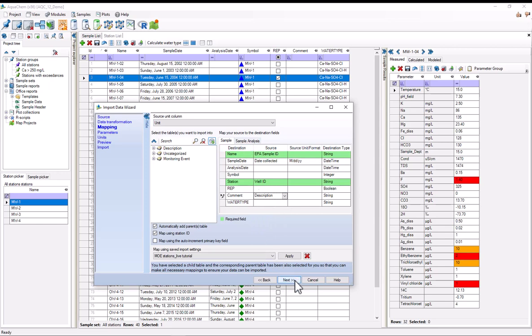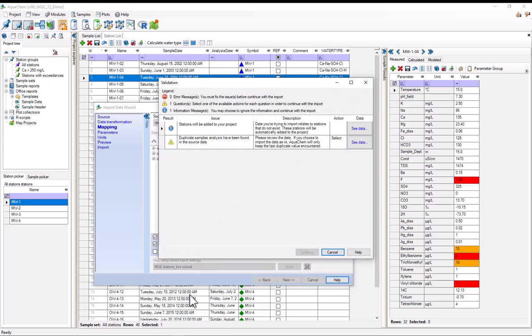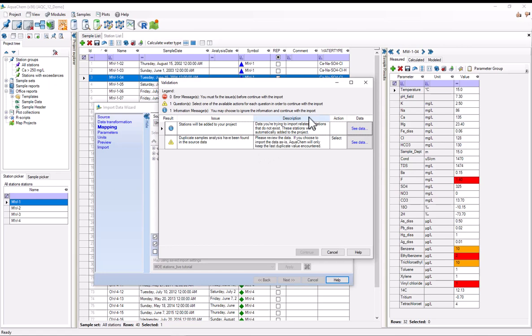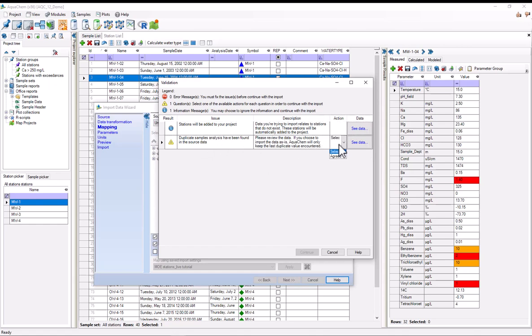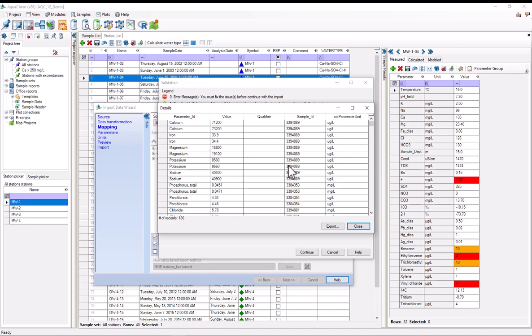But before I can do that, AquaChem has a couple notices for me. For one thing, there were a bunch of stations in this data that aren't in the project yet. Thankfully, AquaChem just allows you to automatically add these stations to the project. And I've got the ability to see which stations will get added by selecting see data. And it's also telling me that I've got some duplicate samples in my data. Here, I basically just acknowledge that AquaChem will only keep the last duplicate value. And I've got the option to see what the duplicates are by selecting see data here. And as you can see, we've got several results here. We've got the same sample ID.